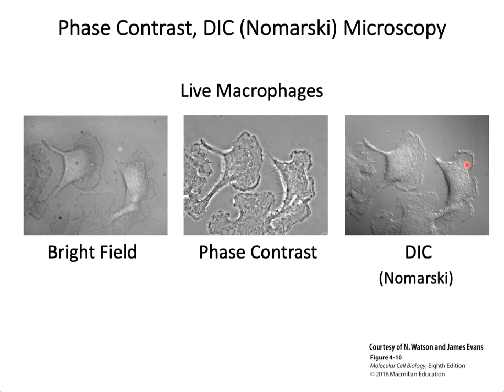DIC, which relies on polarized light, produces a very different image, but very useful. With DIC, you can appreciate that the image is almost a 3D or pseudo 3D image of the cell. So you can gain information about the three-dimensional structure or characteristics of the cell.